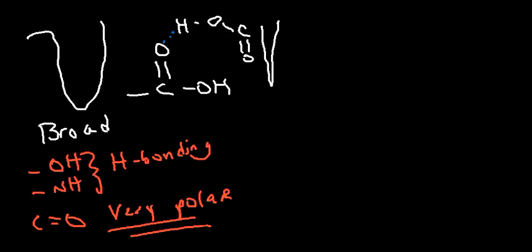And when you have those intermolecular bonds, those interactions create a range of signals in which the sample will absorb infrared, and so that's why it tends to be broad. Same thing with the carbonyl stretch. You have dipole interactions. Here this is partially positive, that's partially negative, so these are attracted to each other. And so anytime you have very polar bonds or hydrogen bonds, it tends to be broad.